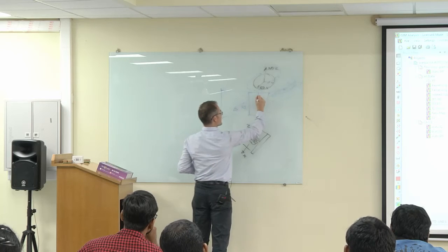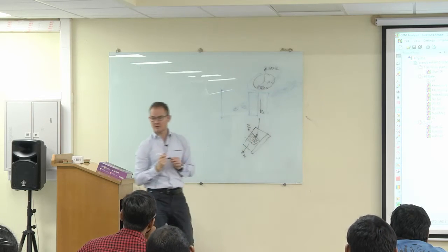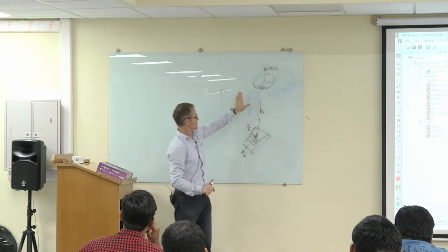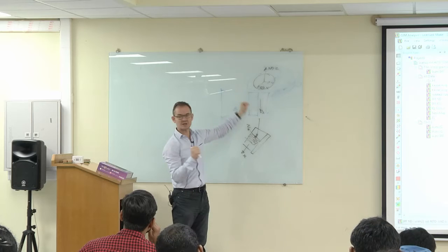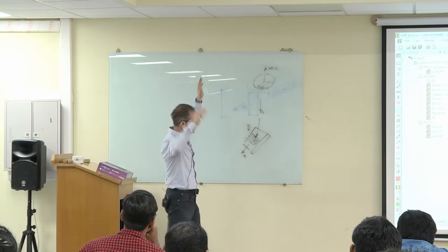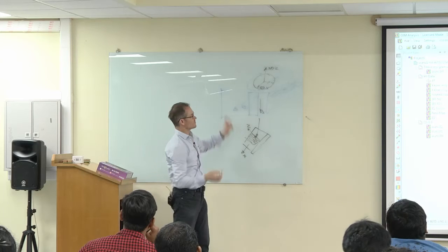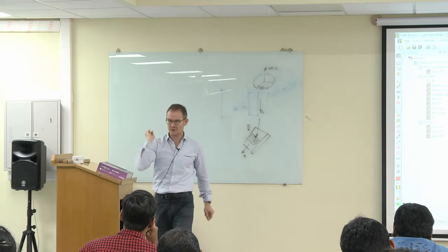So we have called this one here X, which is perpendicular to the previous rolling direction. So you will see a microstructure nicely, no problem, but your reference system is different from the traditional reference system taken usually for a rolled material. Yeah? You could also think that this is a sputtered material, something like that, and you are looking on the cross section in order to see the columnar growth of sputtering. Then also you will not have the proper setup of your sample orientation.